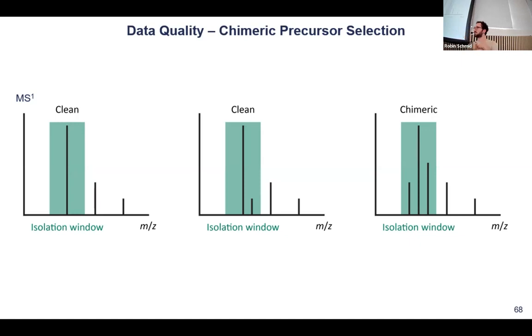So I don't want to tell you that I know how to process spectra. I just want to tell you, I did process my spectra with those settings, and this is the library that I exported, and you can use it, and you know what happened to the spectra.